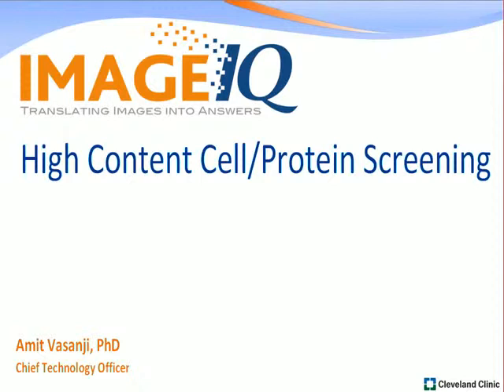Today I'd like to talk about ways that you might be able to improve your high-content cell protein screening.